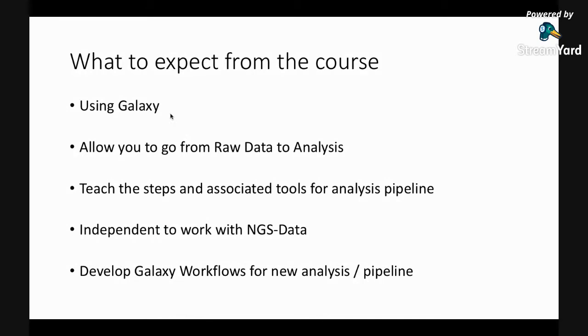So what is the course about? It is about doing next generation sequencing analysis, but using Galaxy. This will be our tool of interest. It's a very powerful tool, so it should be able to do everything that you want. This would be something that we'll be using.